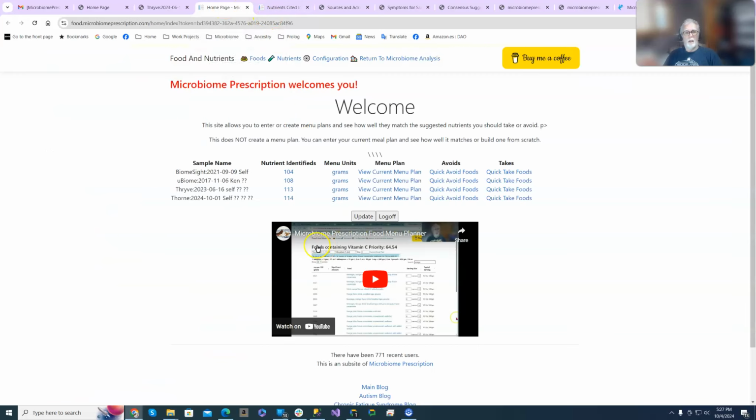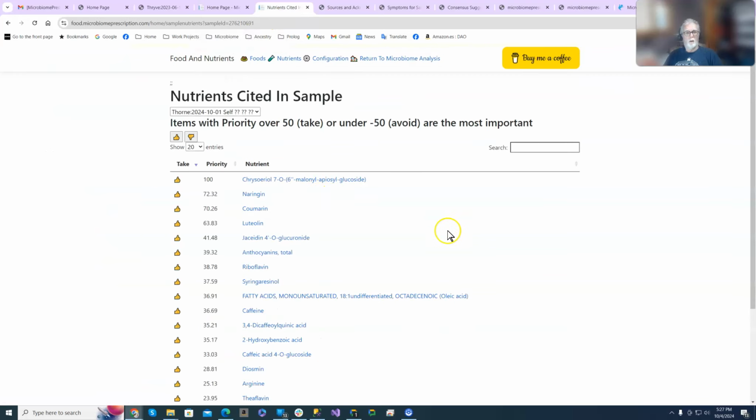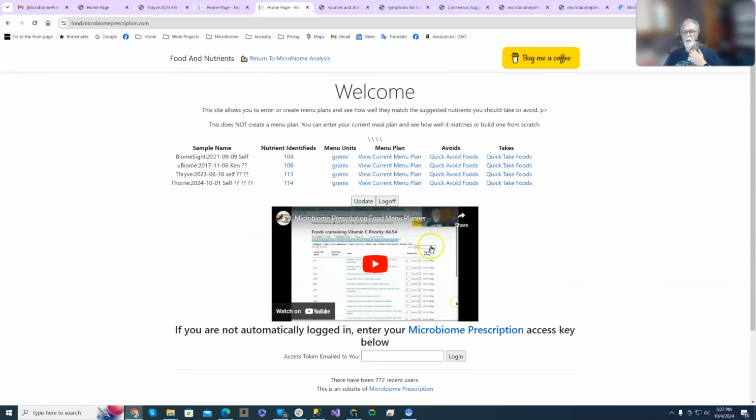So let's go back here. And here we have that. Now, that gives you how to manually go through. However, we try making life easy. We have lists of quick takes and quick foods, which are ones you should probably pay more attention to.